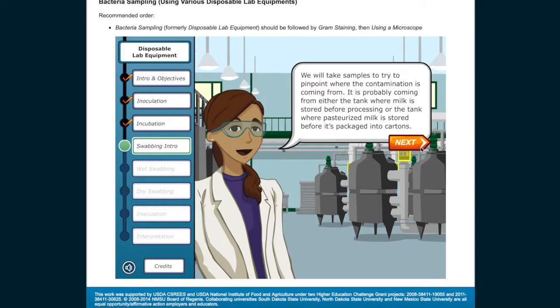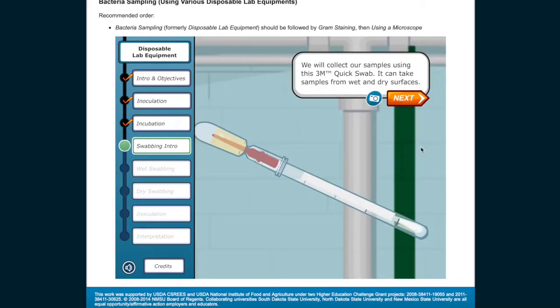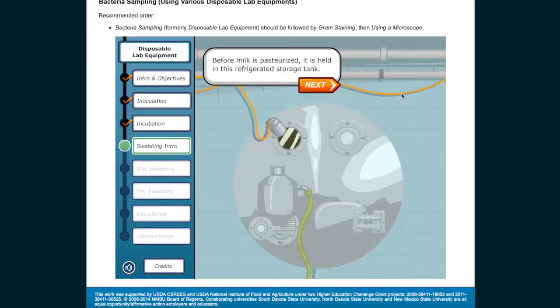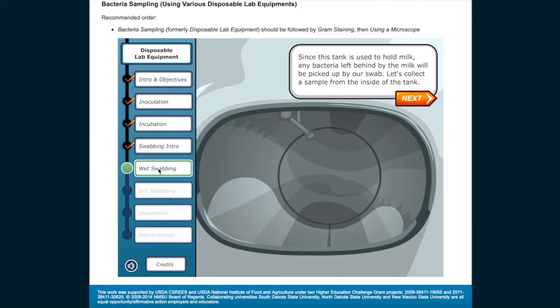We will take samples to try to pinpoint where the contamination is coming from — it is probably coming from either the tank where milk is stored before processing, or the tank where pasteurized milk is stored before it's packaged into cartons. We will collect our samples using a 3M quick swab, which can take samples from wet and dry surfaces. Before milk is pasteurized, it is held in this refrigerated storage tank. Let's collect a sample from the inside of the tank.